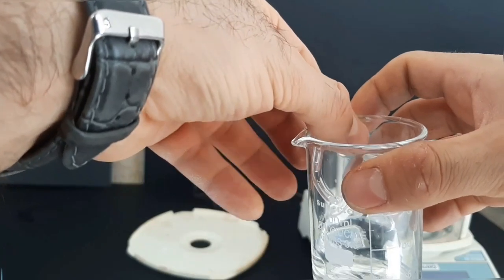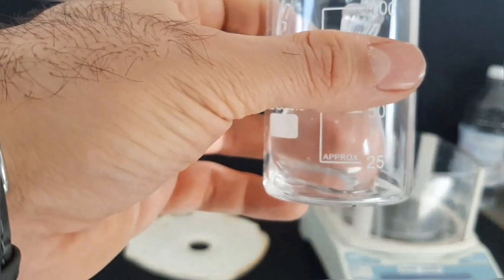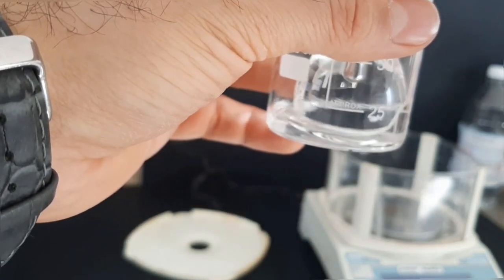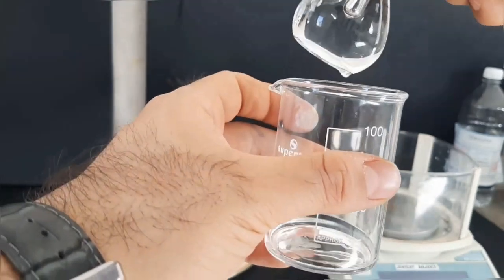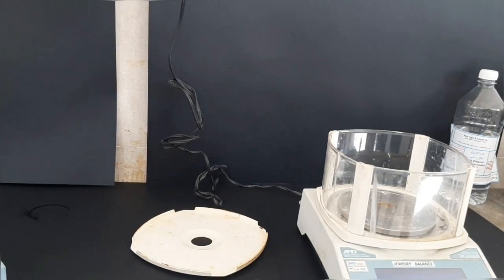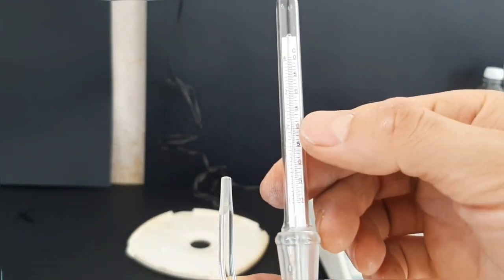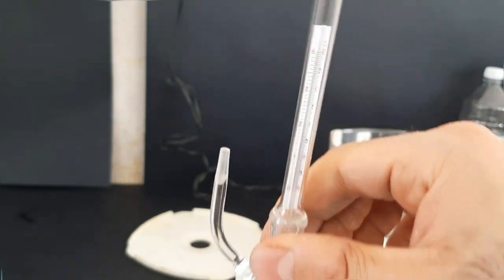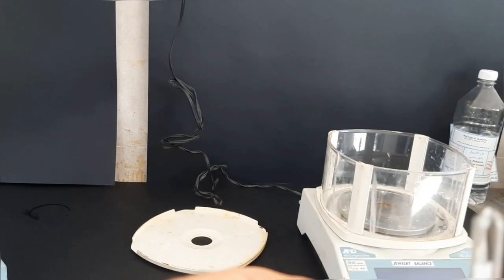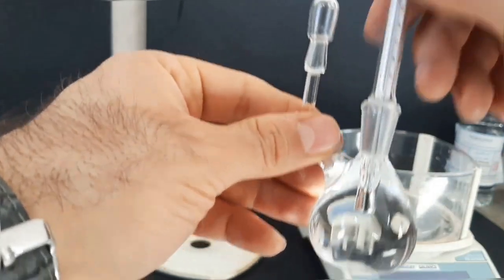And what we need to do is to push down the thermometer into the pycnometer to spill out the excess of the solvent in it. You can put the thermometer in a beaker to prevent splashing. So we're going to read the temperature. When it reaches 20 degrees, which is the calibrated temperature of this pycnometer, you're going to put the cap on, dry it off, and take the weight.